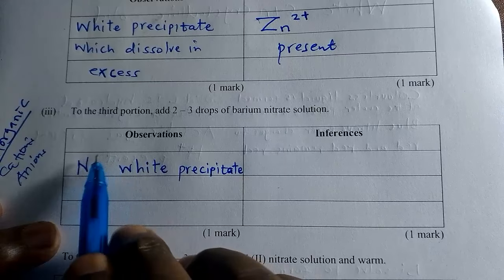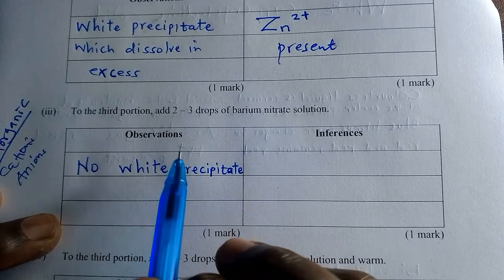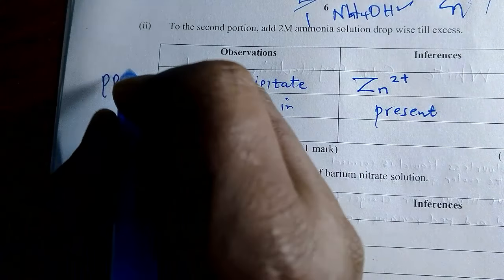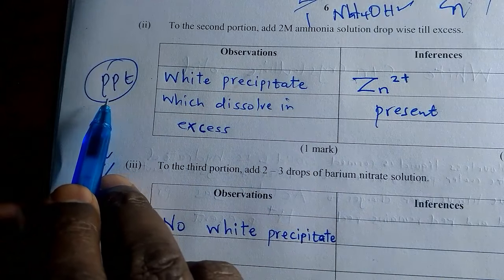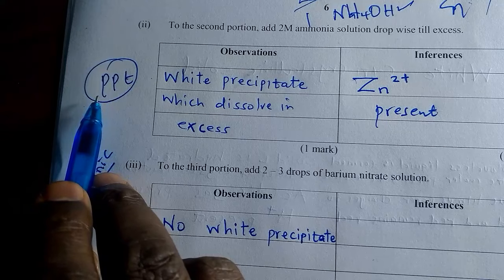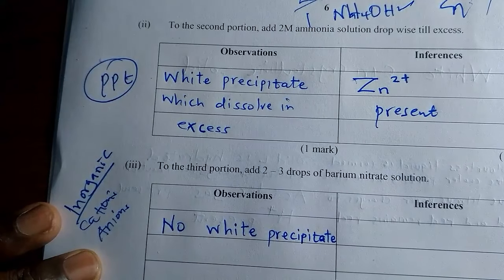To the third portion, add 2 to 3 drops. And let me tell you something. Do not write PPT. Don't use the shortcuts. They want to ensure that lazy people will not pass. From 2010 until recently, 2023 or 2024, they were marking this one.